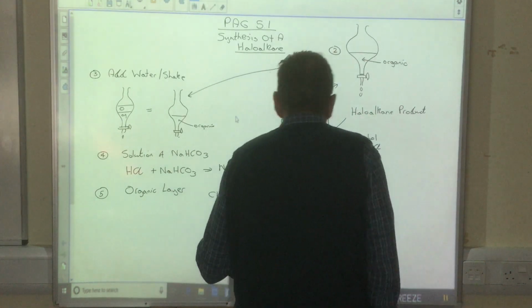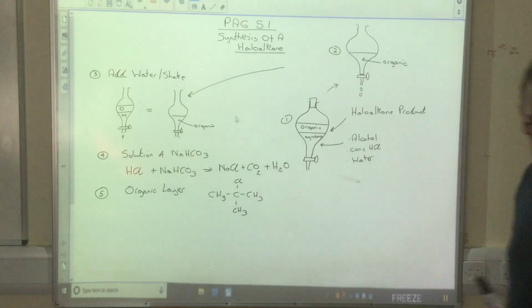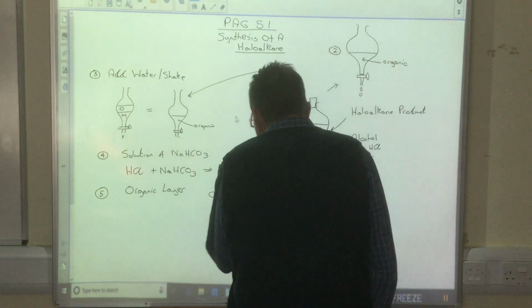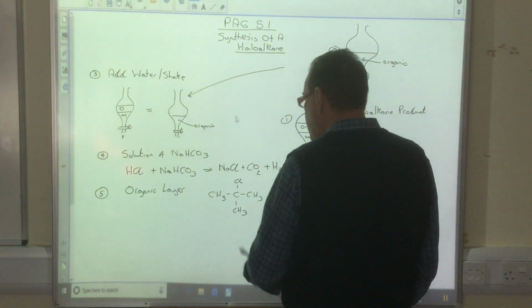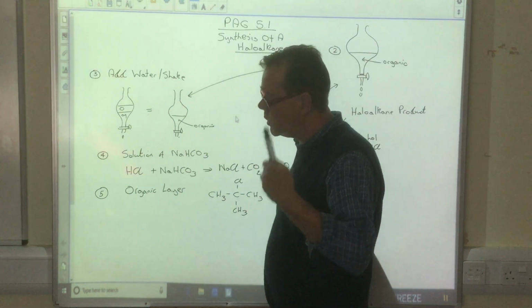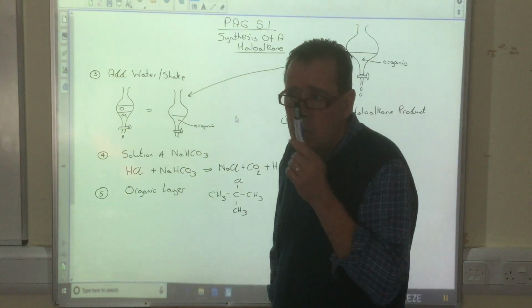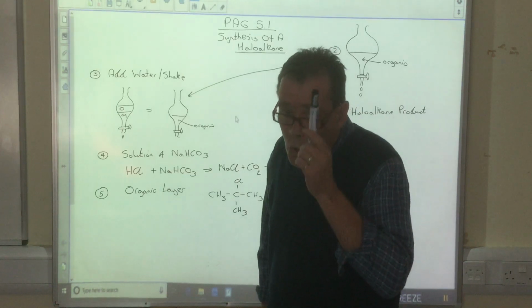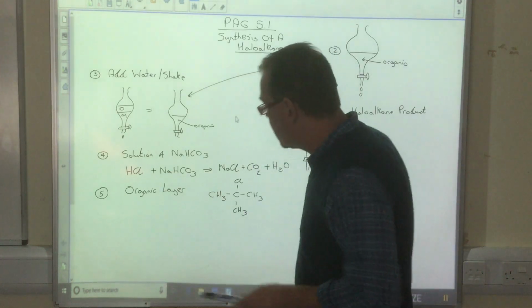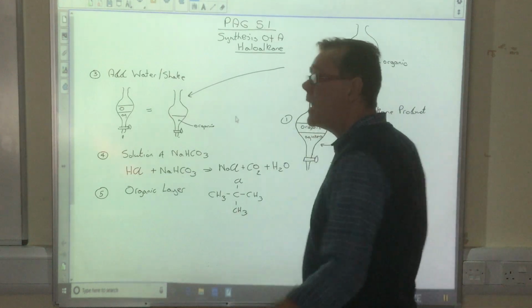But all organic reactions have impurities, you know what I mean? This is just the organic layer, but now you've got rid of your aqueous stuff, you've got rid of a lot of crap. Now you can use a more refined technique to purify your organic product exclusively, okay? And the organic product that you're going to have exclusively is this. How do you do that?